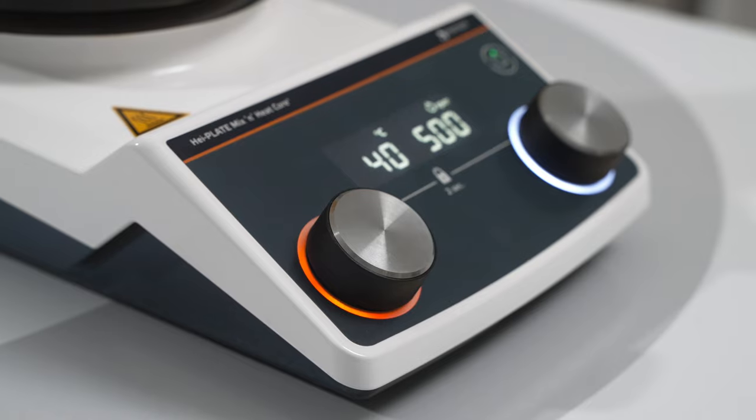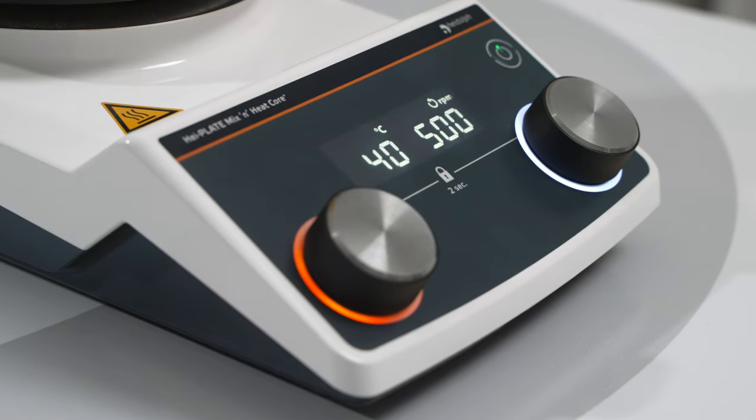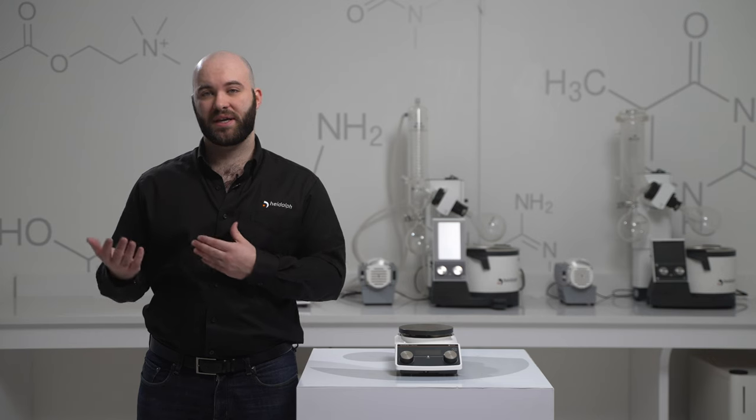Both buttons have illuminations below them so from afar you can see whether or not your hotplate is heating or mixing.